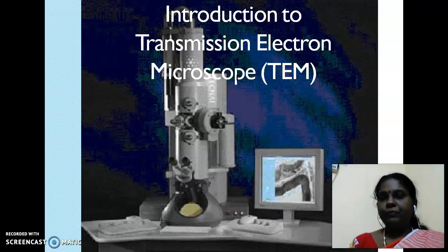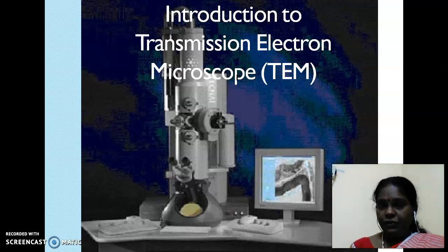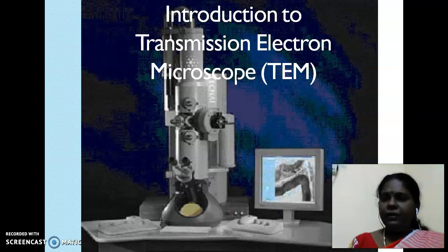this range. So if the magnification of the optical microscope is raised higher and higher, can we see an atom? Unfortunately, the answer is no. To overcome this, engineers like Ruska in Germany devised the electron microscope. What is an electron microscope? In an electron microscope, the source of illumination is a high energetic beam of electrons.